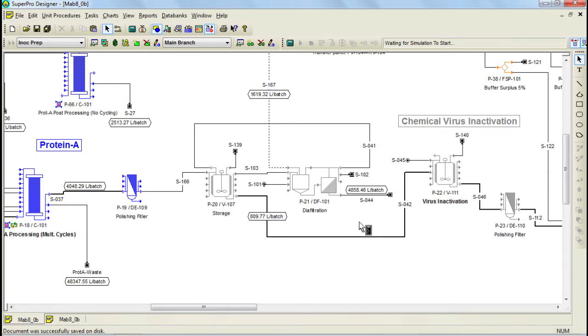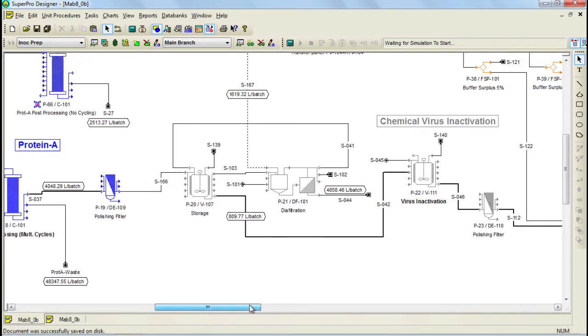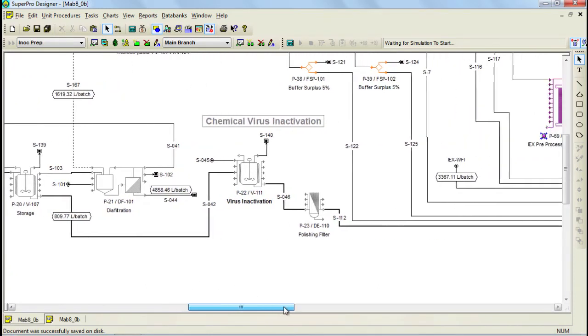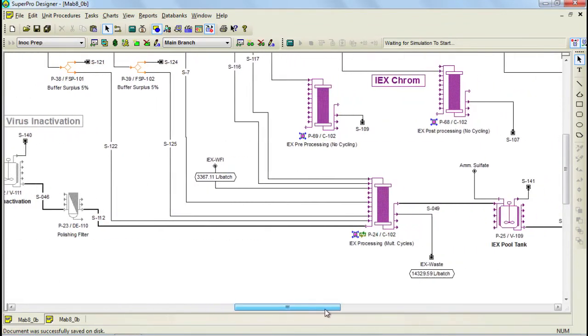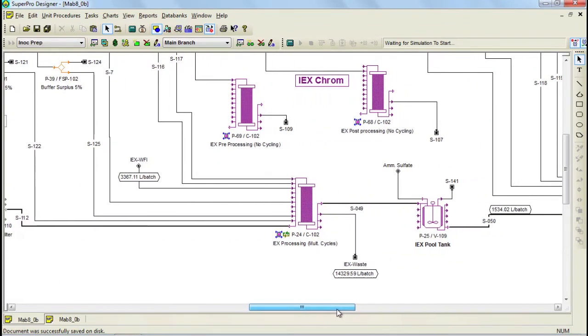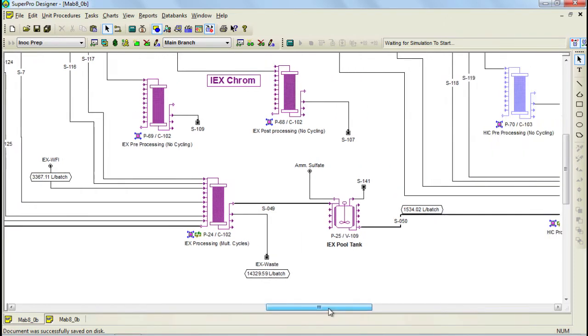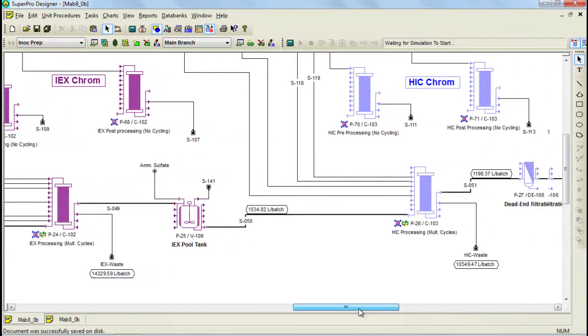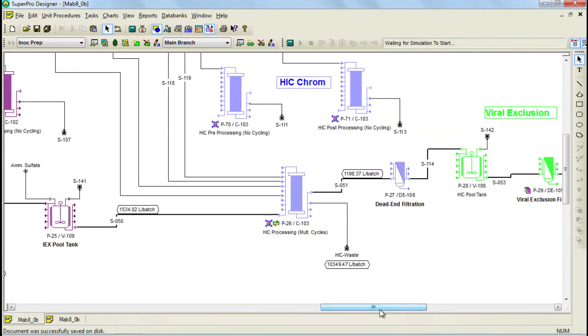This is then followed by an ion exchange chromatography step which is again operated in cycles and therefore divided into three unit procedures. The product is collected in a tank where ammonium sulfate is added to increase the ionic strength of the material prior to the hydrophobic interaction chromatography step that follows. Again this step has been divided into three unit procedures.